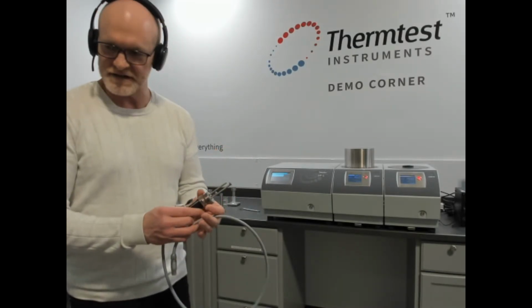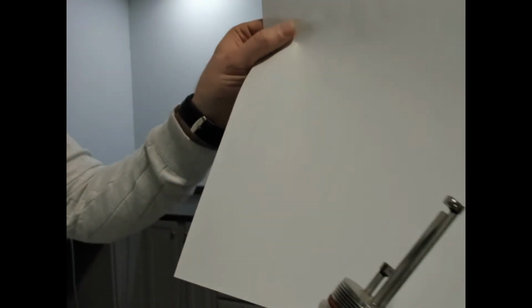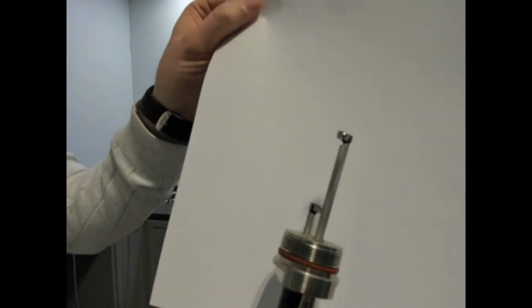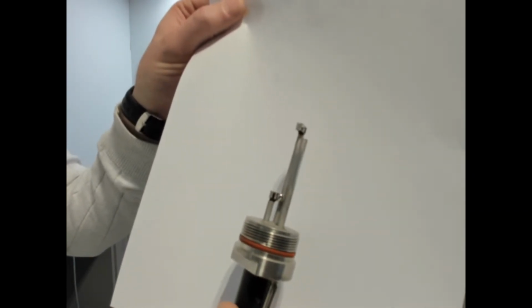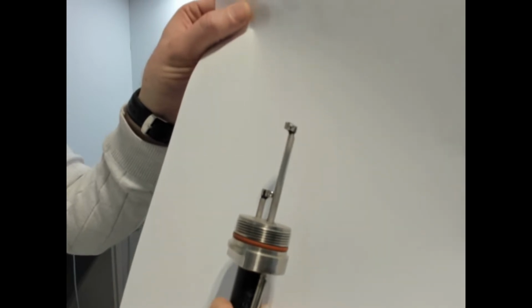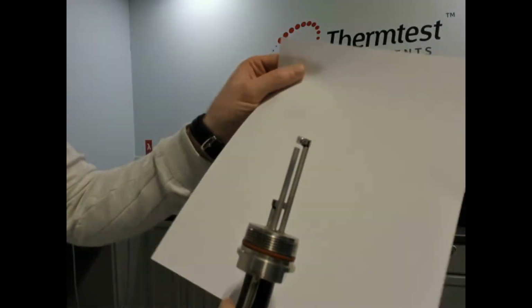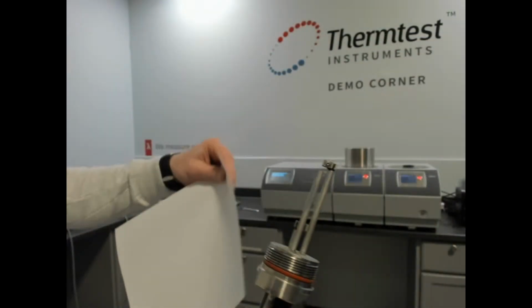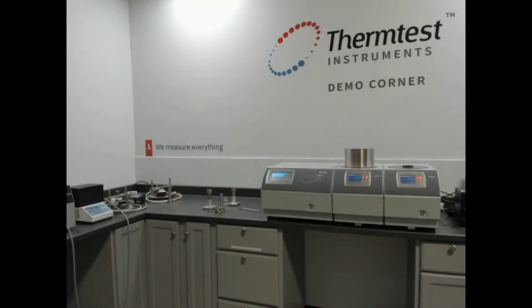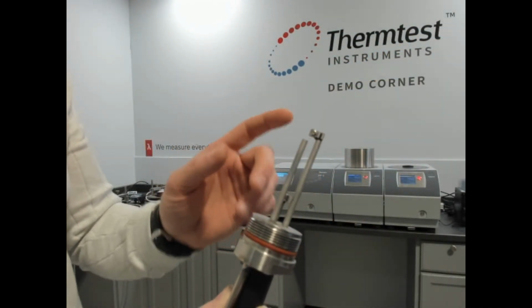So I'm going to pull this a little closer to the camera, talk a little bit about the sensor that we have. I'm going to try to get this focused. We're going to do our best. So there is a platinum wire that's suspended between 2 contact points. You can see there's a screw that connects the wire on the bottom, and then there's another screw that connects the wire on the top. Hopefully you can see that. It is a little difficult. It's a very thin platinum wire. The principle there is that we pass a current through that wire and we generate a small amount of heat.